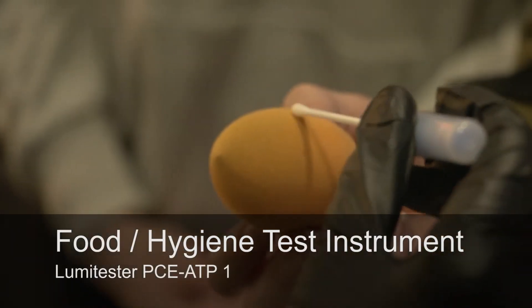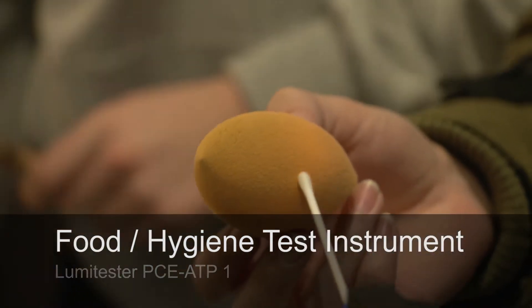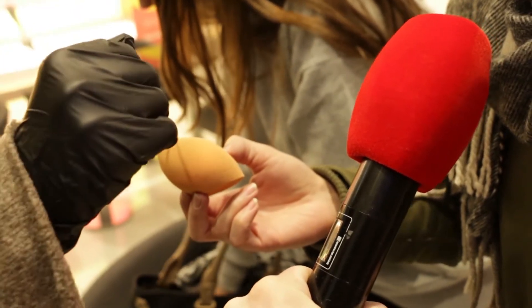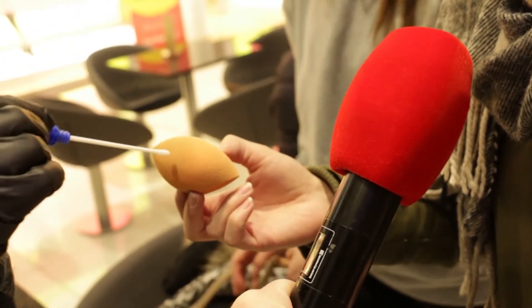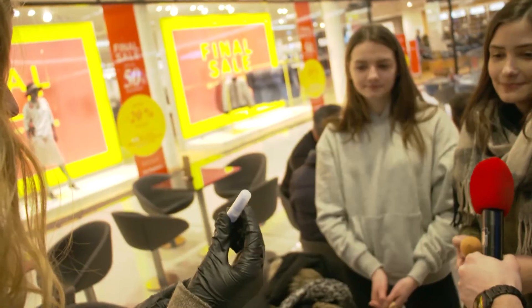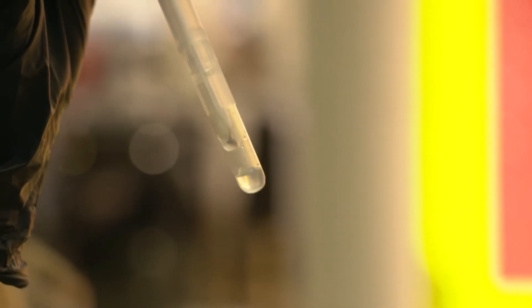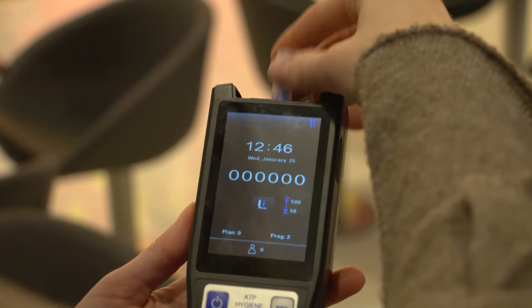To use the PCE ATP, you need to buy the swab, which is sold separately, and take a sample of the surface to be tested. Press the swab all the way down into the tube so the swab comes into contact with the reaction liquid and reagent. Gently shake the tube to ensure the sample is fully covered.